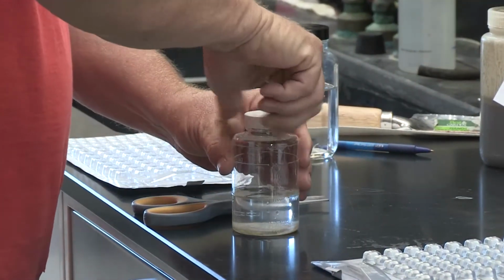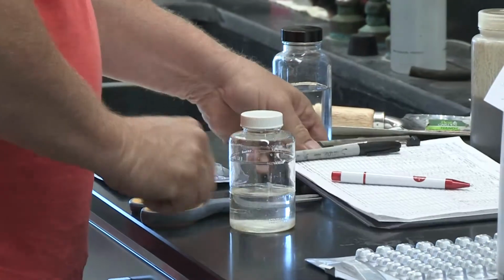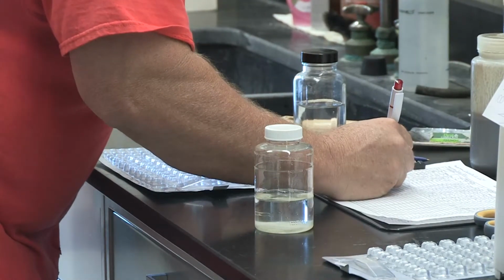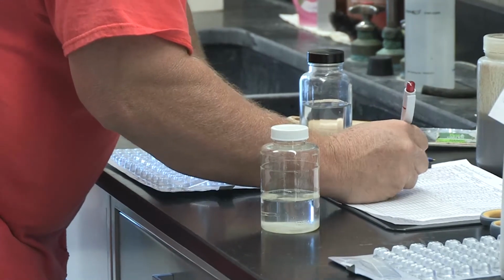So E. coli is present in just nature. It's present in our bodies. It's present everywhere. So this test, you have to be very careful. We don't touch the inside of the rim because you have E. coli even potentially on countertops anywhere. So that's a bottle that's been sterilized.